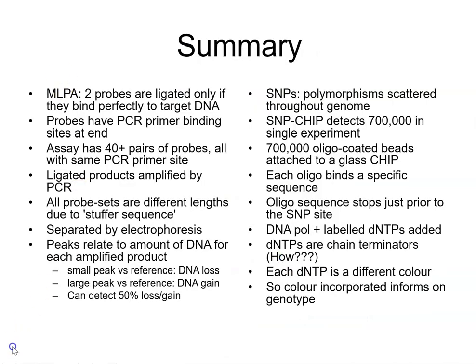Okay, on this slide you've got a summary of everything I've covered in Lecture 1, MLPAs, and Lecture 2, single nucleotide polymorphisms and pathogenic mutation detection strategies by various different methods. So that's everything that we have covered.